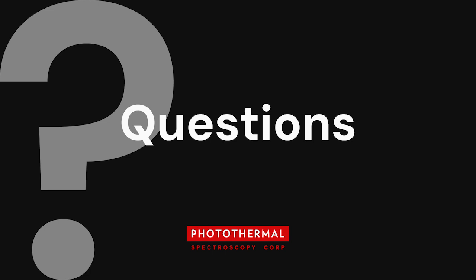Yeah, that's a good question, and we discussed it also internally. Surprisingly, if you collect an infrared spectrum from pure glass, the glass bands are extremely weak. And so only when you focus on the cell, the glass bands are elevated. So I suspect this could be a lensing effect, because for the small red blood cell, the glass background is less intense than for the larger white blood cells.